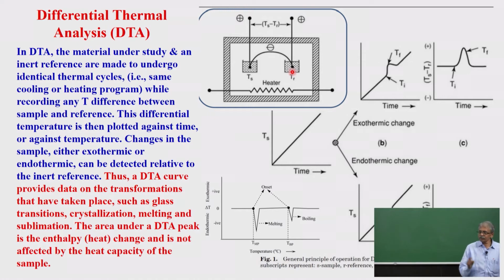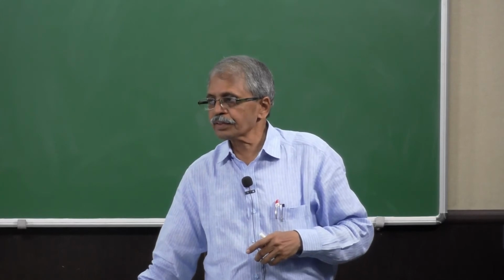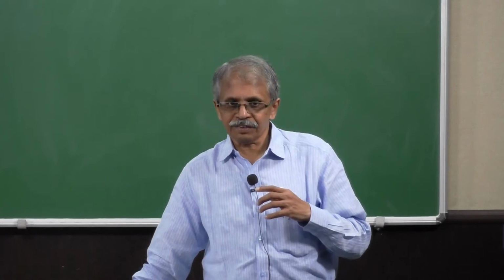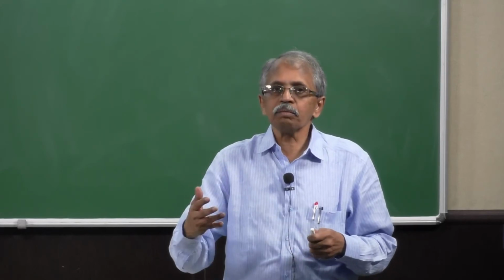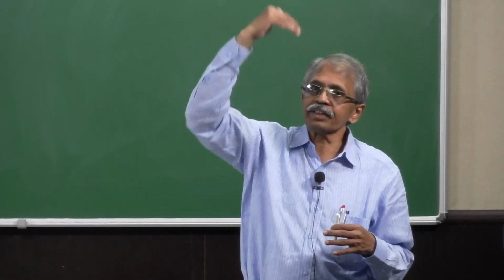That is what you are going to measure. Not the weight loss, not the weight difference, but the temperature difference between the reference and the sample. But your heating profile is same for both. You are heating both of them at the same temperature, but one of them will have a difference in temperature as compared to the other, this is the reference, this is the sample. That can be either temperature increasing or temperature decreasing with respect to the reference. So, you have already heard in your early studies about exothermic and endothermic processes. So, the temperature difference lowering is endothermic, temperature difference increasing is exothermic.